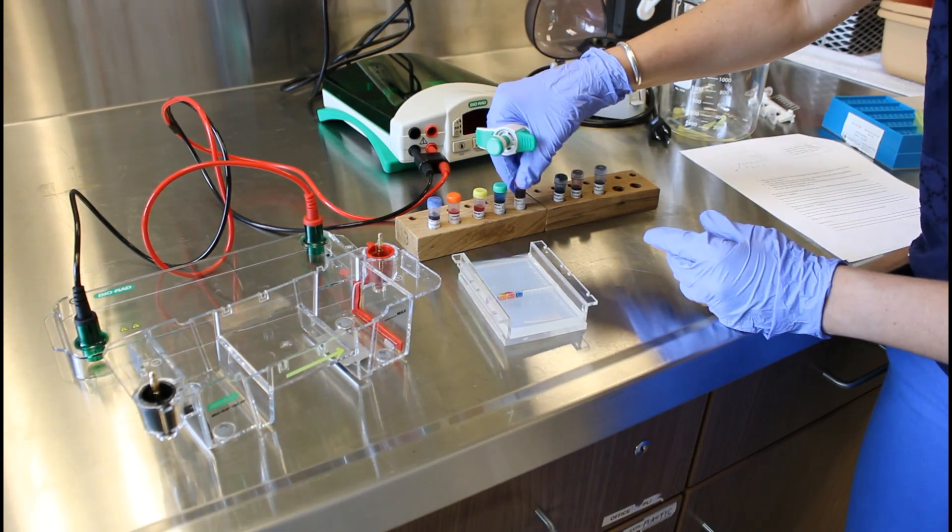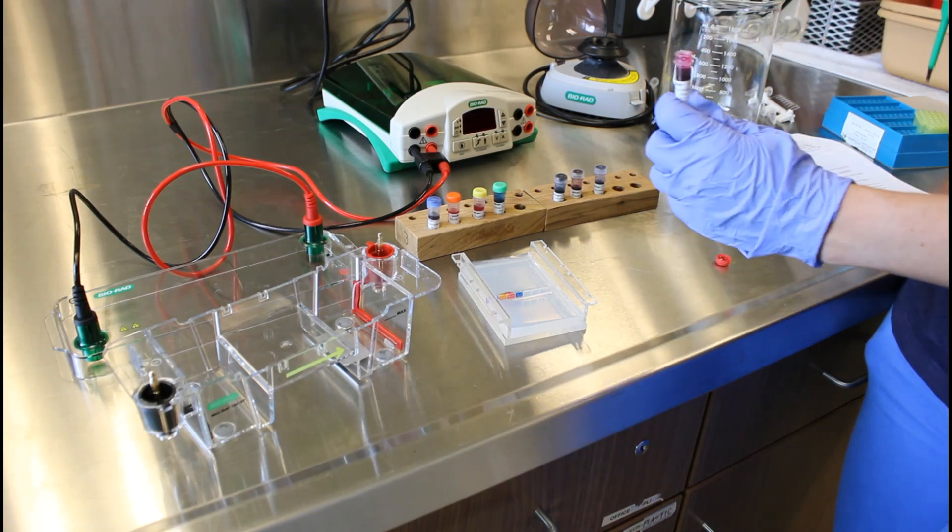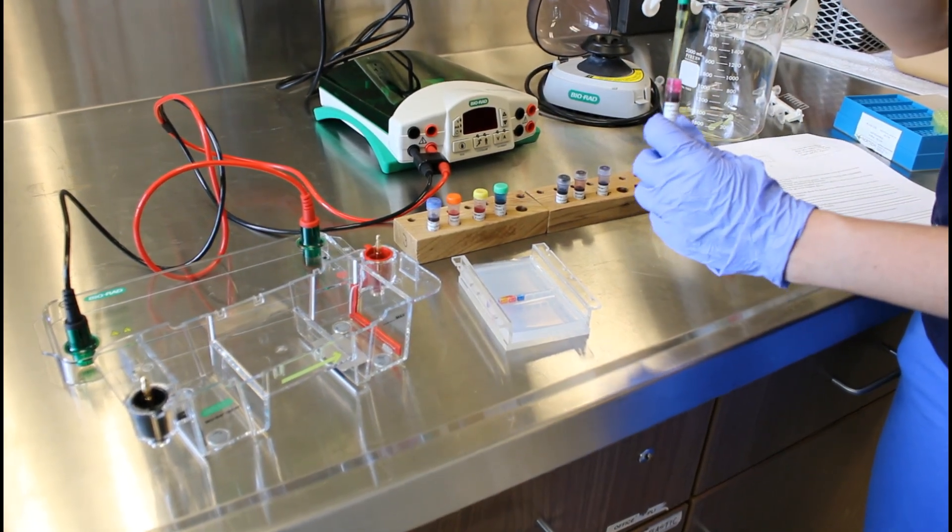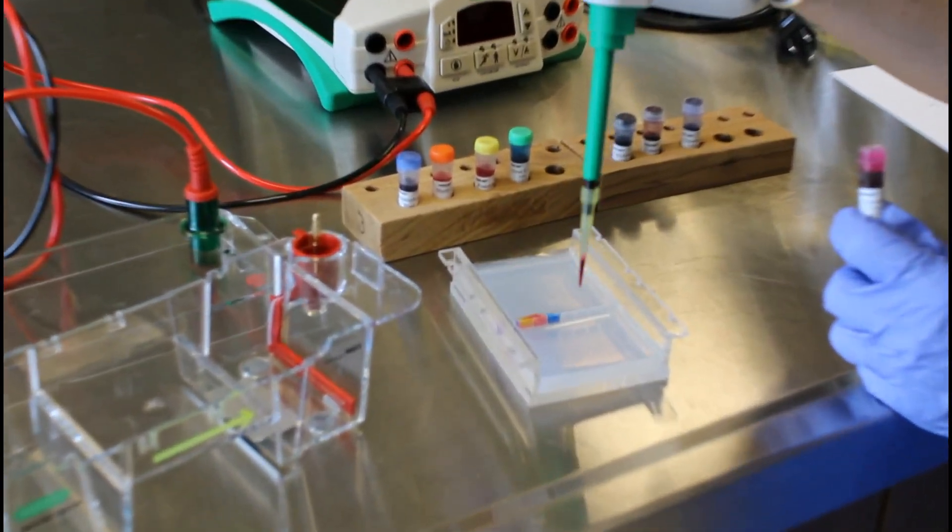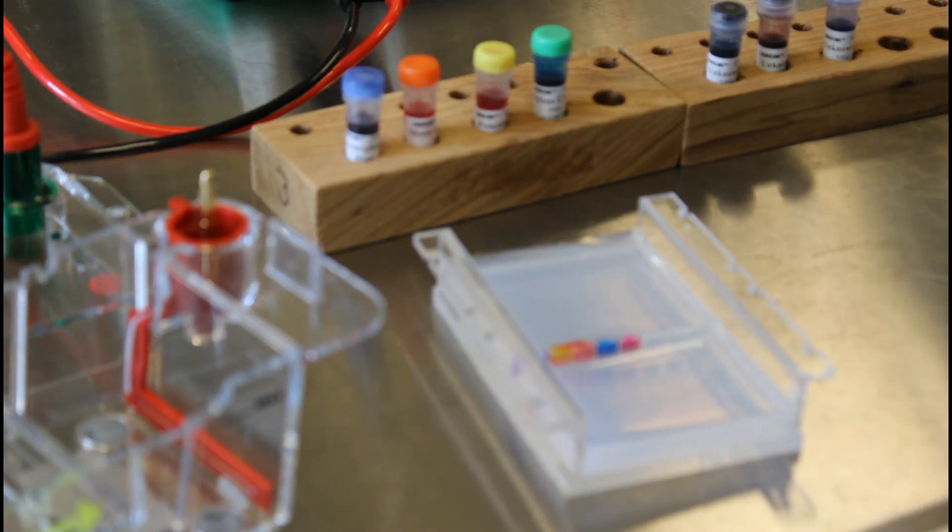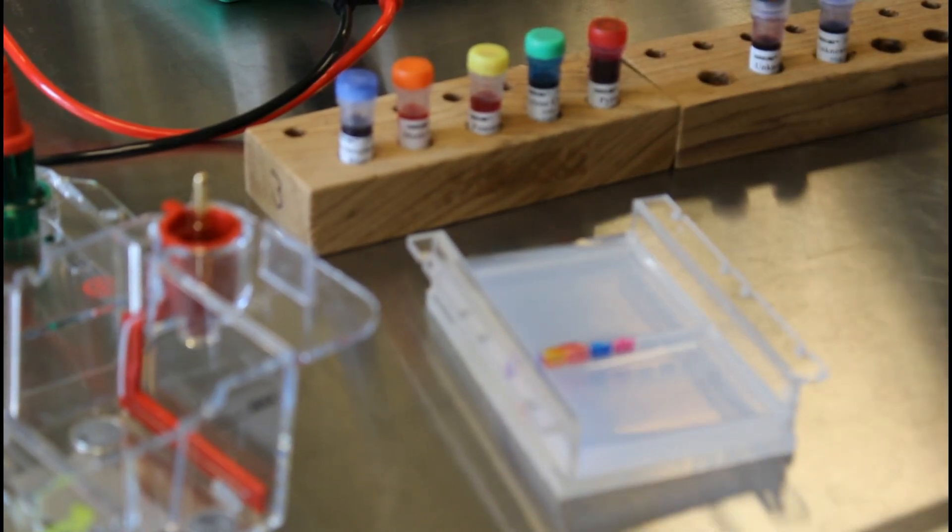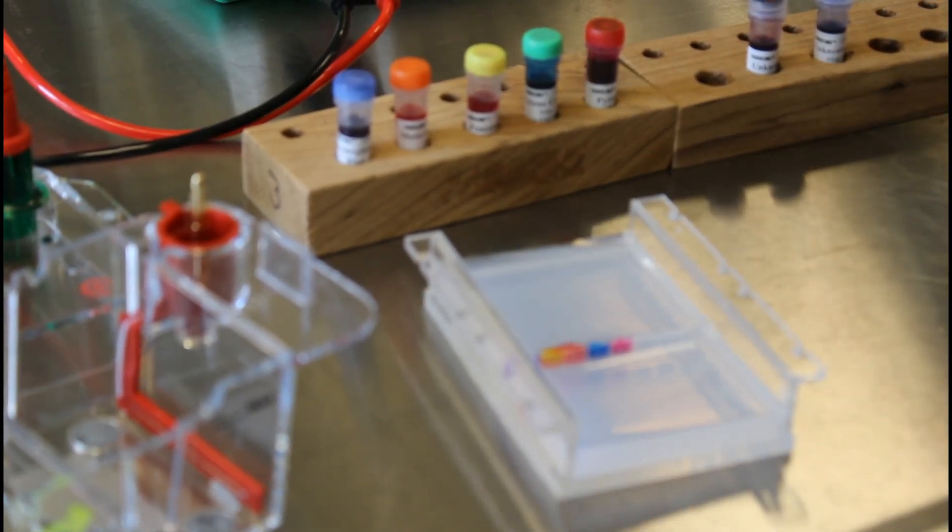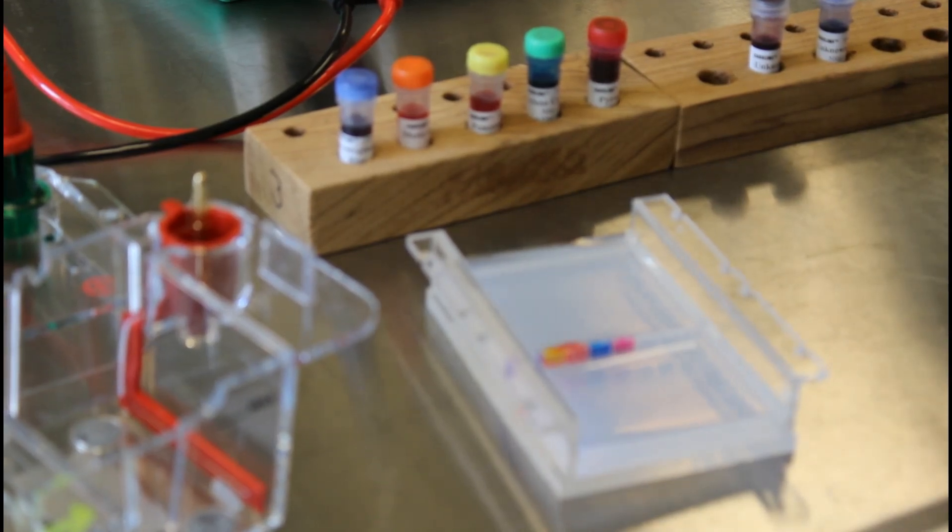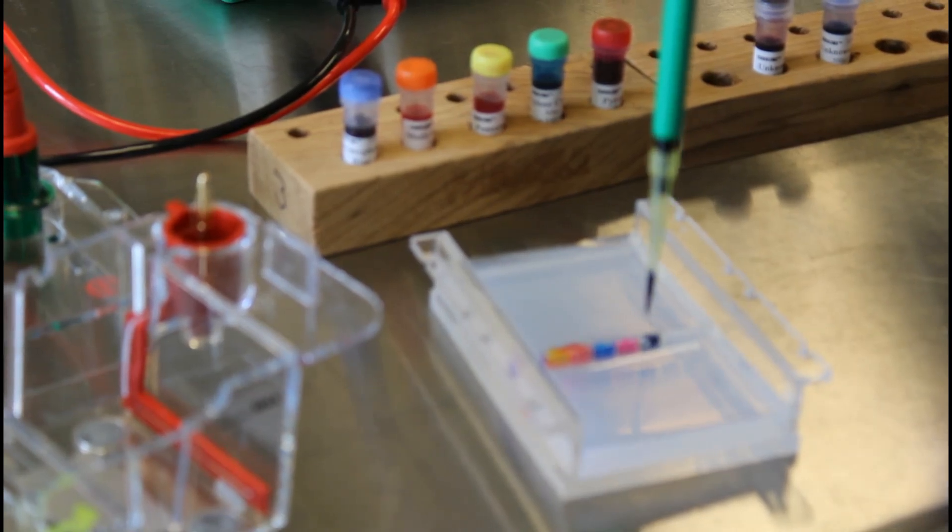And then I have this pyronin Y or PY. I'm going to grab a fresh tip, put this in the fifth well over. And now we're going to start loading up the unknowns. Each time I'm going to grab a fresh tip. This is our unknown one going next to the PY. Once again 20 microliters into the well.